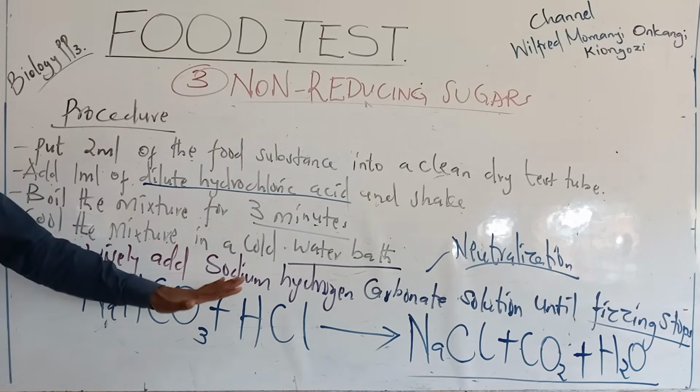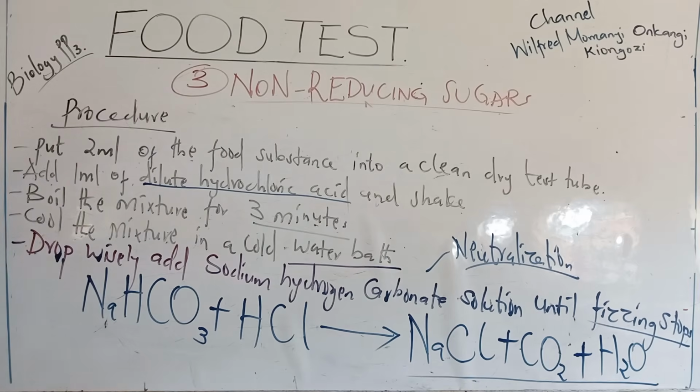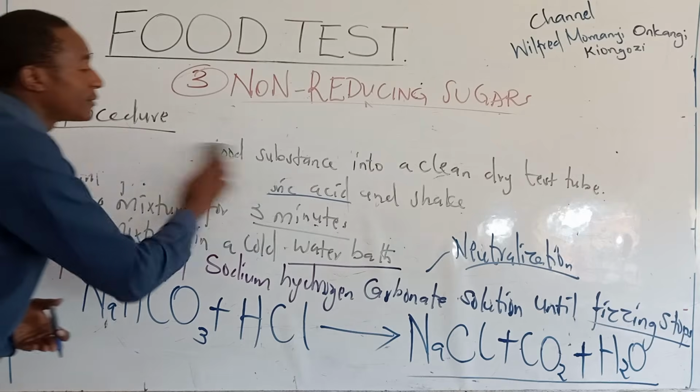What happens after that? Now, you add another reagent. You go to the next procedure.